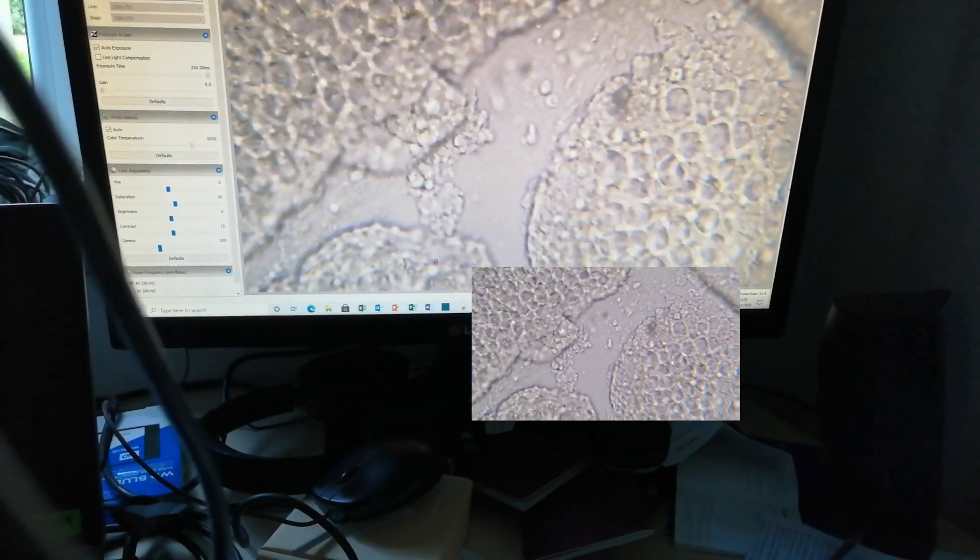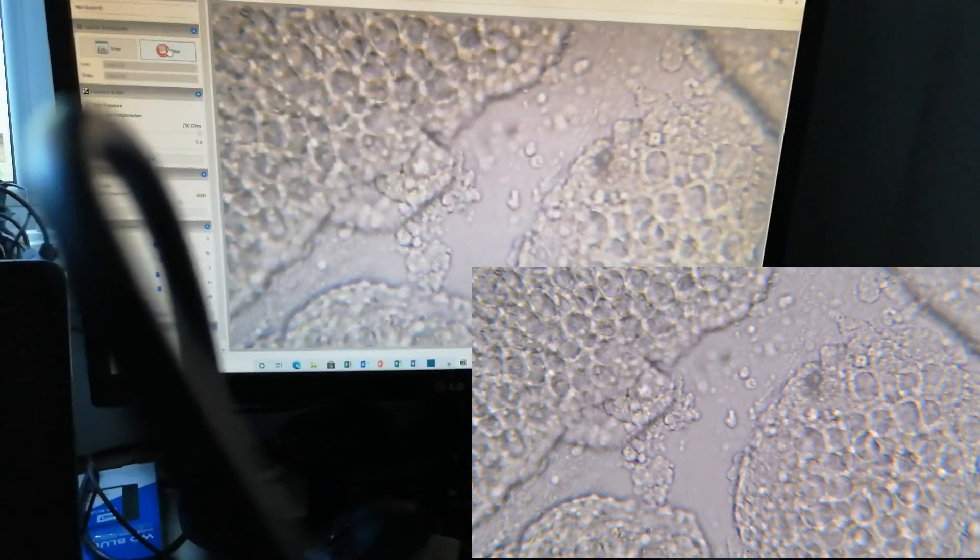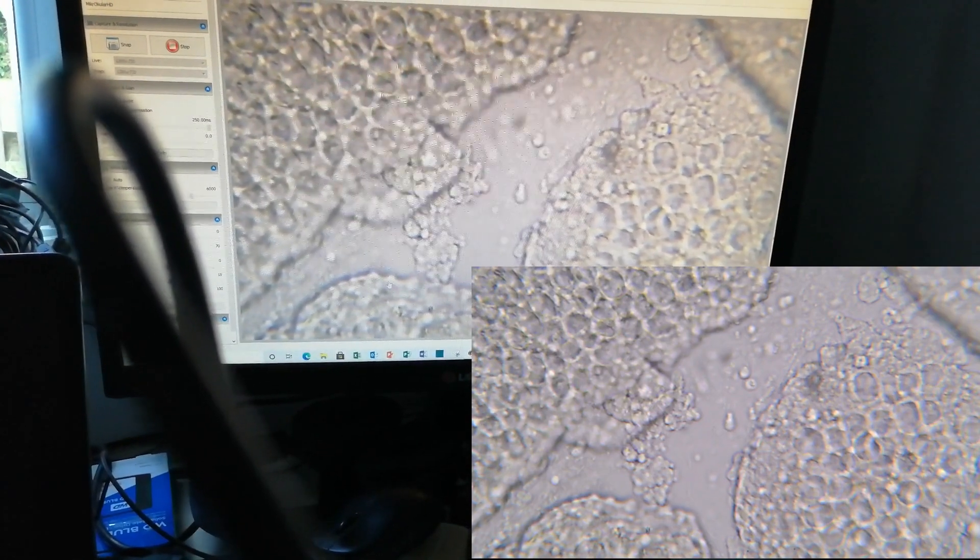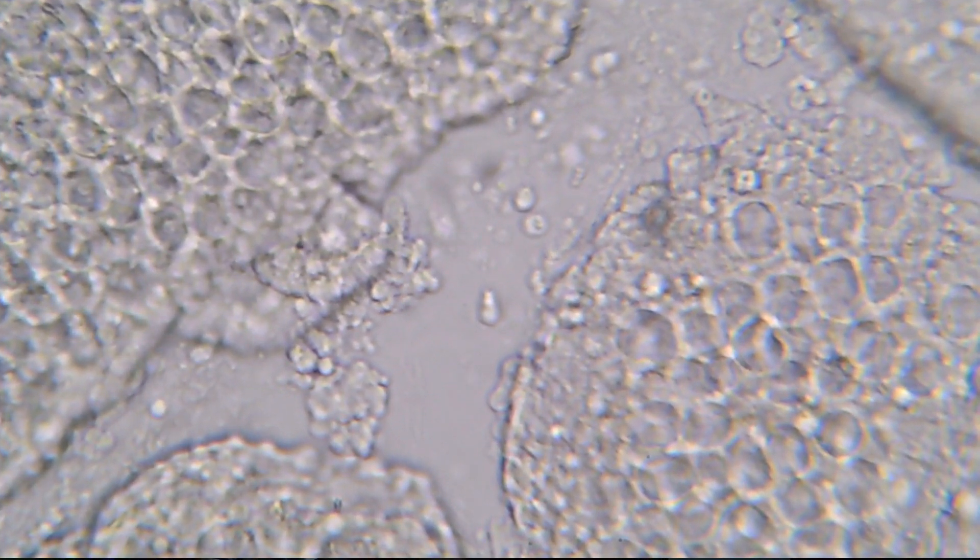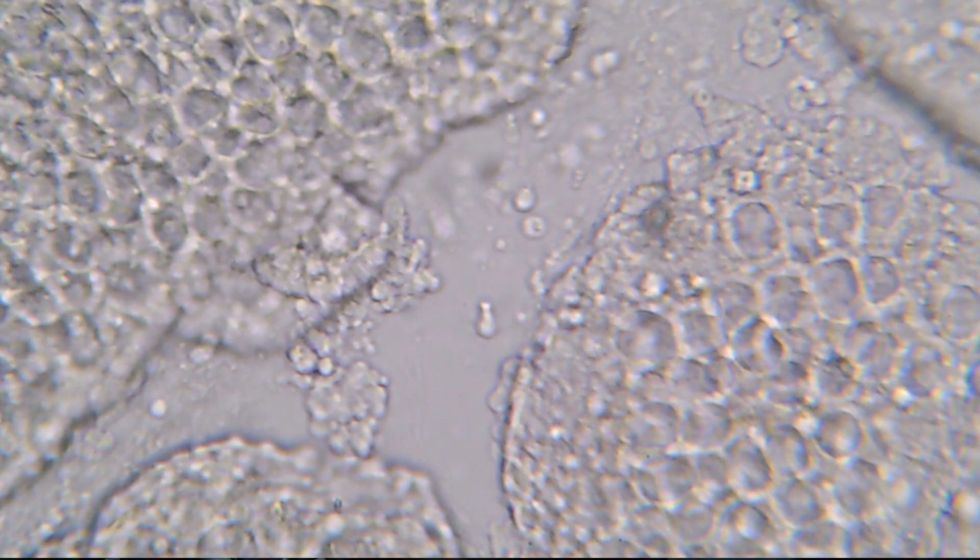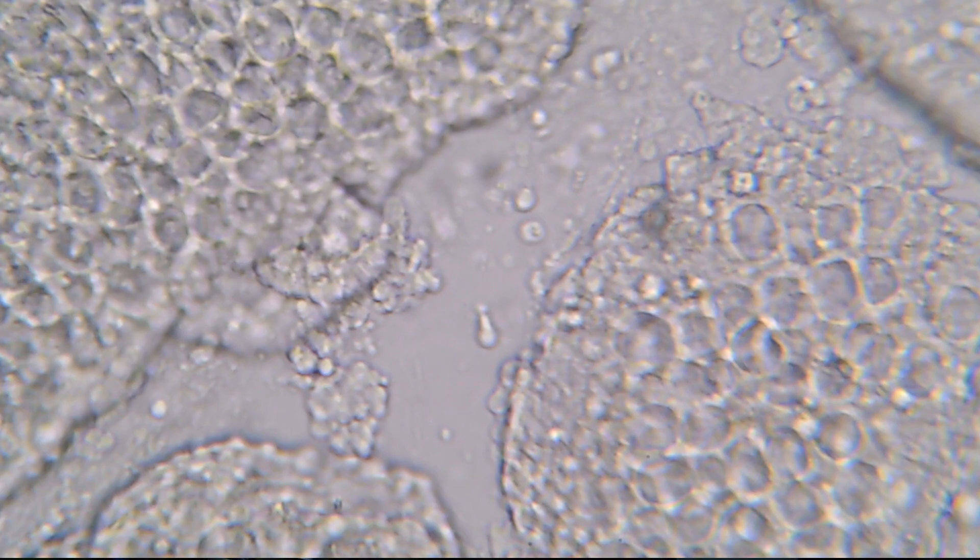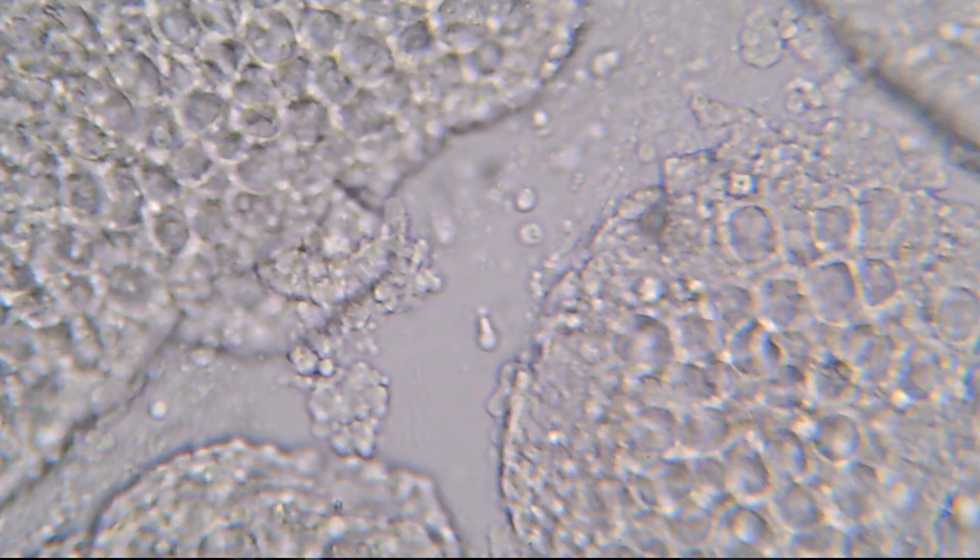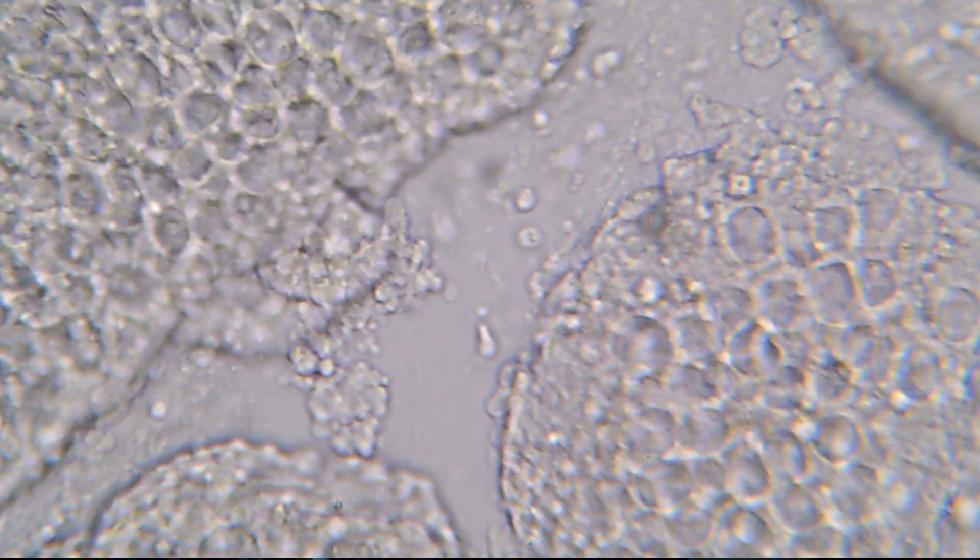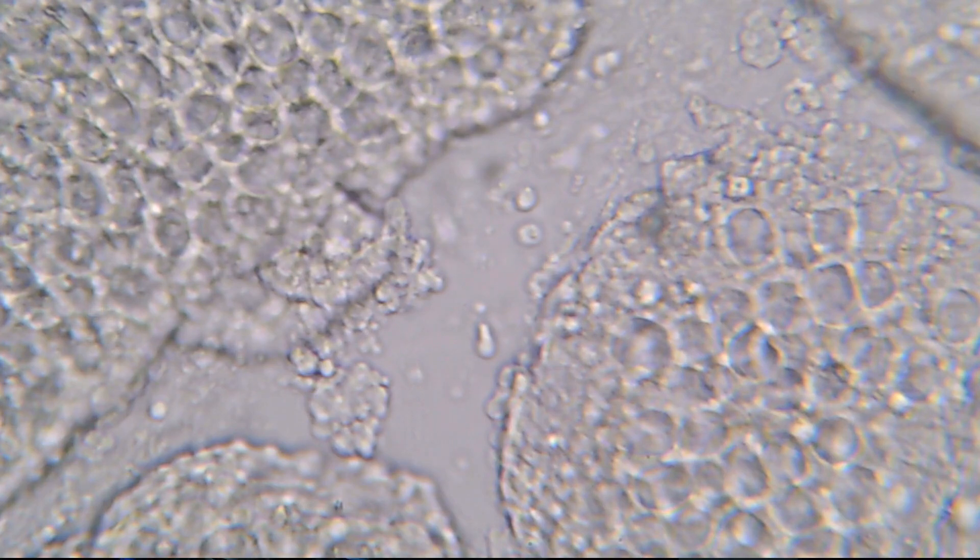This is where I normally catch any movement. I'd probably use the recording from the PC for this. It's in gaps between cells, blocks of cells, so you've just got water, water, and then there's a flow through. Generally you do see movement here, but it's just following the flow of water. If you see anything at all that's not just flowing through, going in different directions, whirling, twirling, that's generally where in my experience you would see parasites. So far I've seen nothing to indicate parasites.